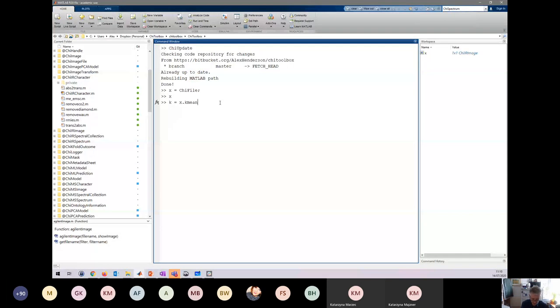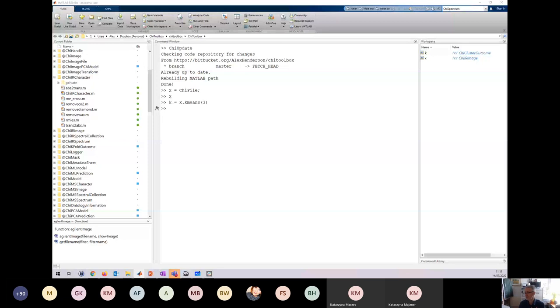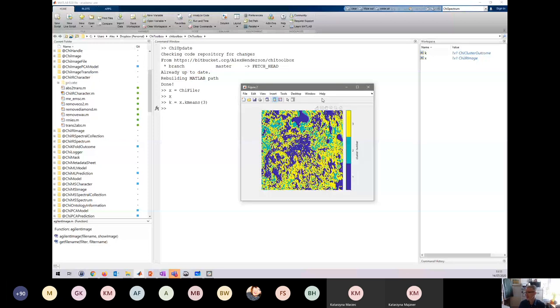We say x.kmeans and, as was mentioned, we need to say how many classes — let's say three. There's no semicolon so it outputs. That's doing k-means clustering on that image. And there it is — that was nice. We have other things: you can remove wax by chopping out a region, or go from transmittance to absorbance. There's the k-means image. That's produced a cluster outcome because it's the result of a clustering experiment.